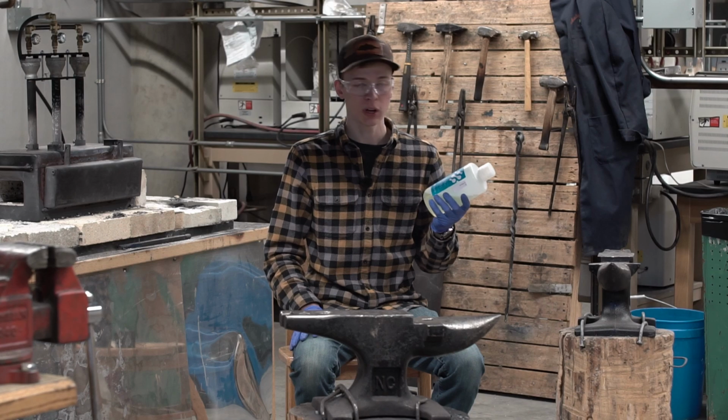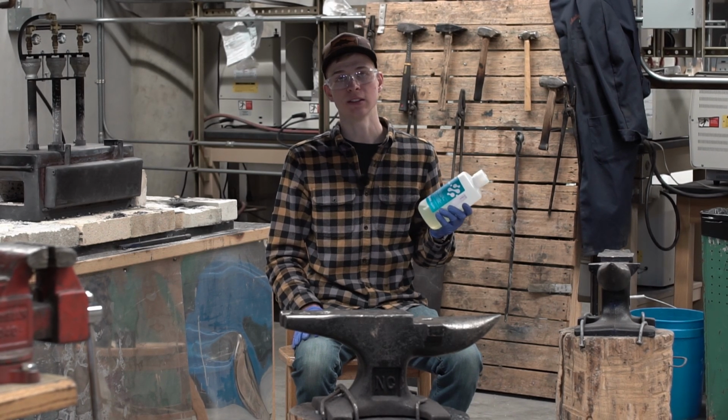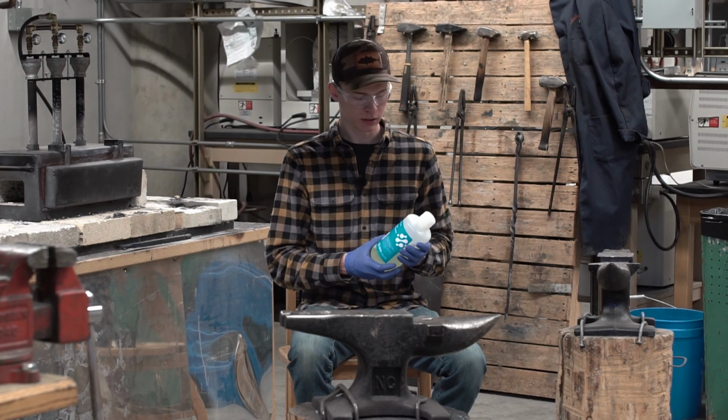This is tunable up to a certain level. About the most you can go with sodium polytungstate is a specific gravity of 3, but you can always make it less dense if you want.